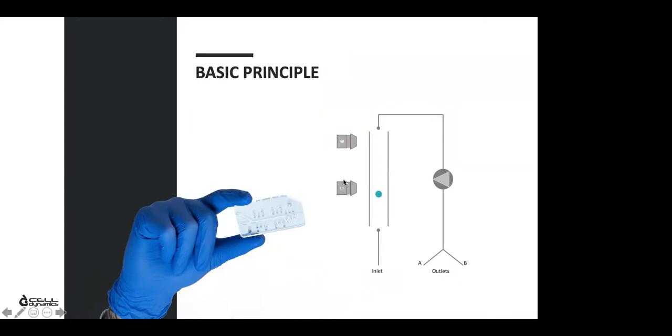It means that our samples are carried just above the field of view of the camera, and in this particular moment, we stop the peristaltic pump and we let the spheroid fall down only by gravity force. So as such, the instrument tracks the spheroids during their free fall motion throughout the analysis channel with the buffer at rest.